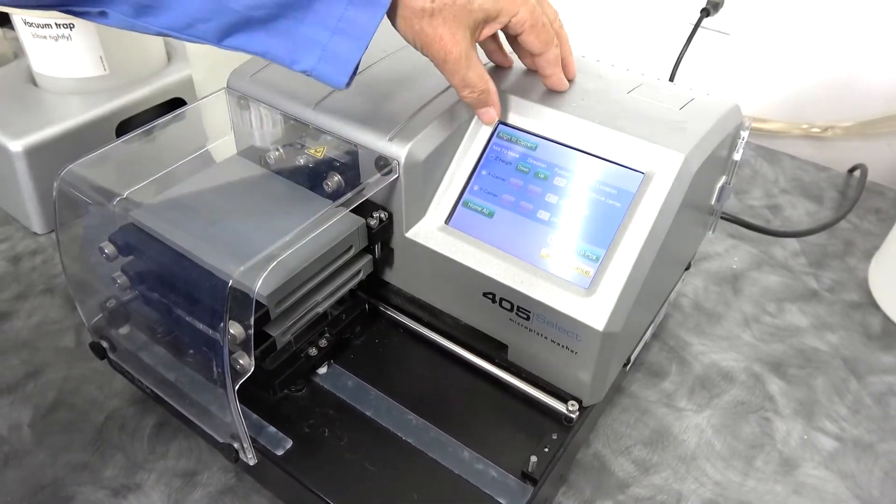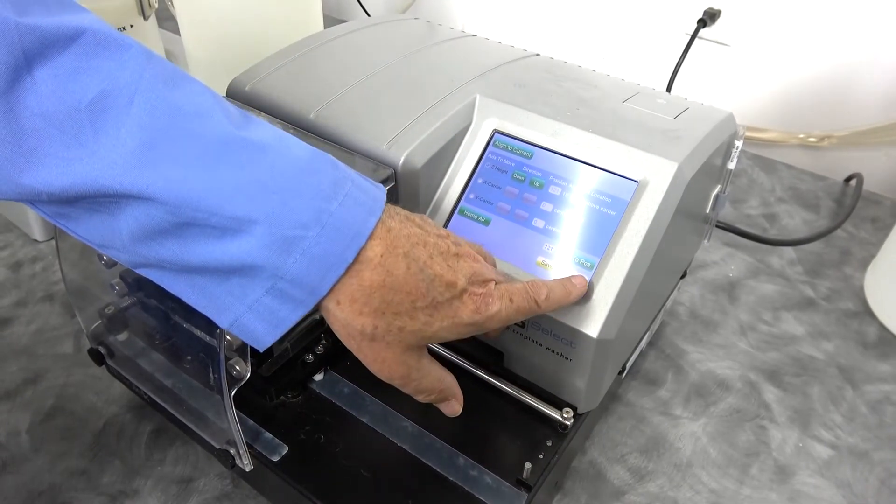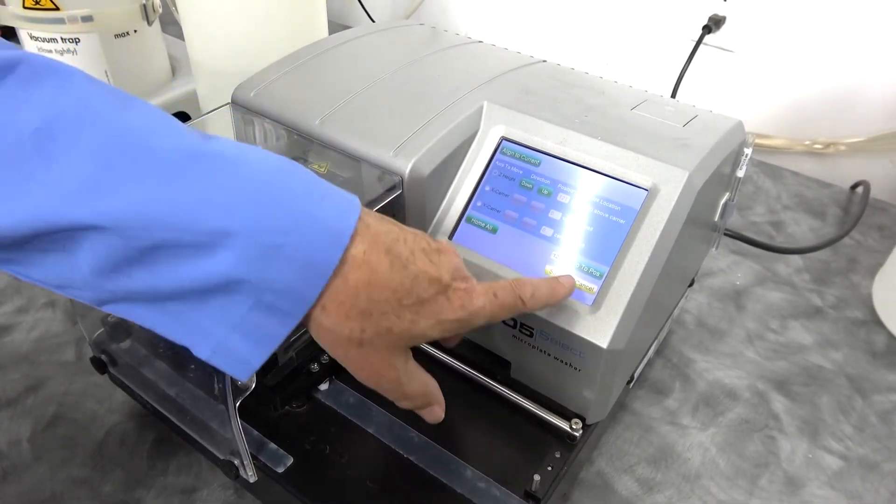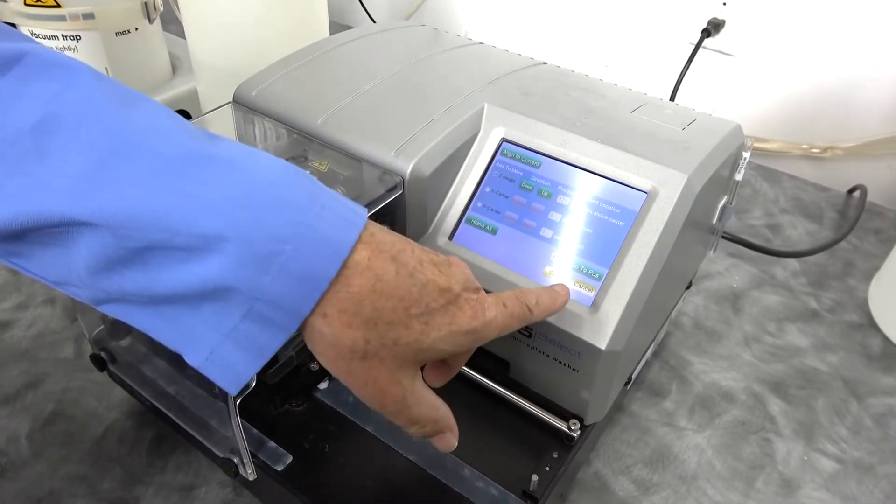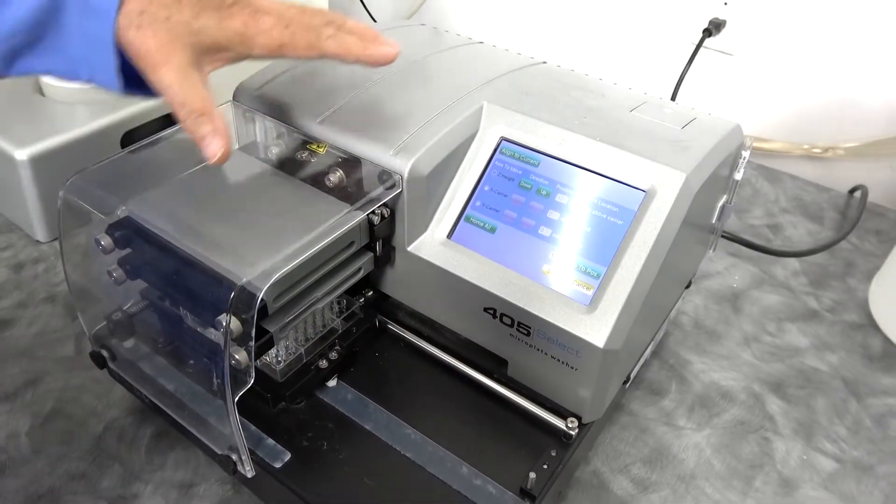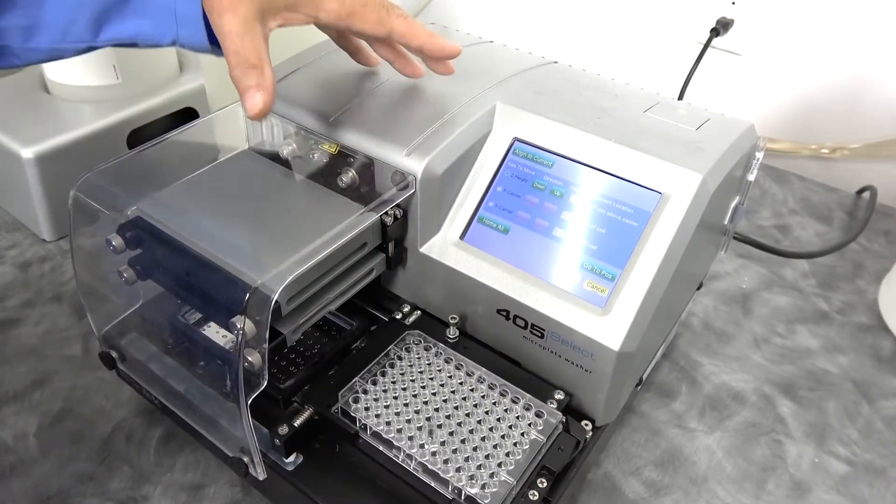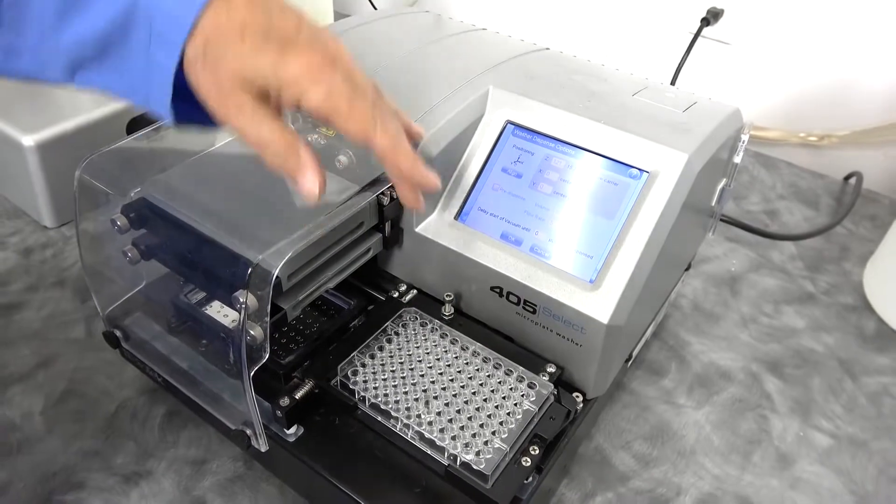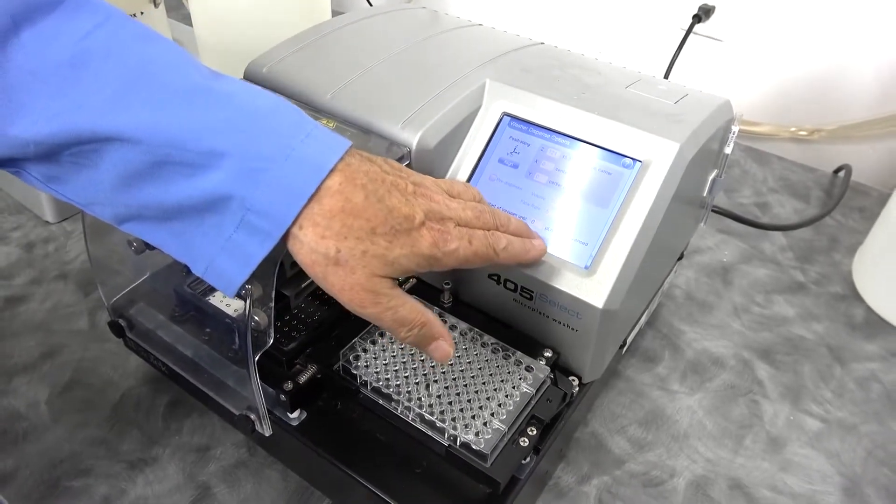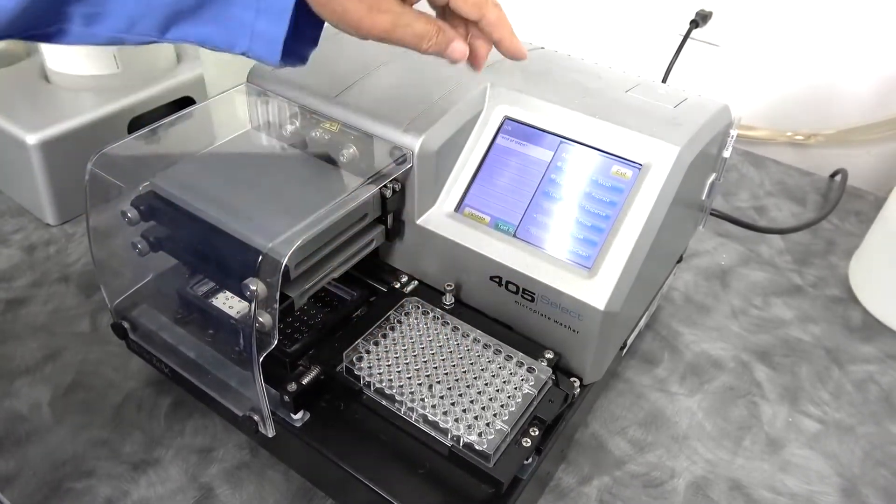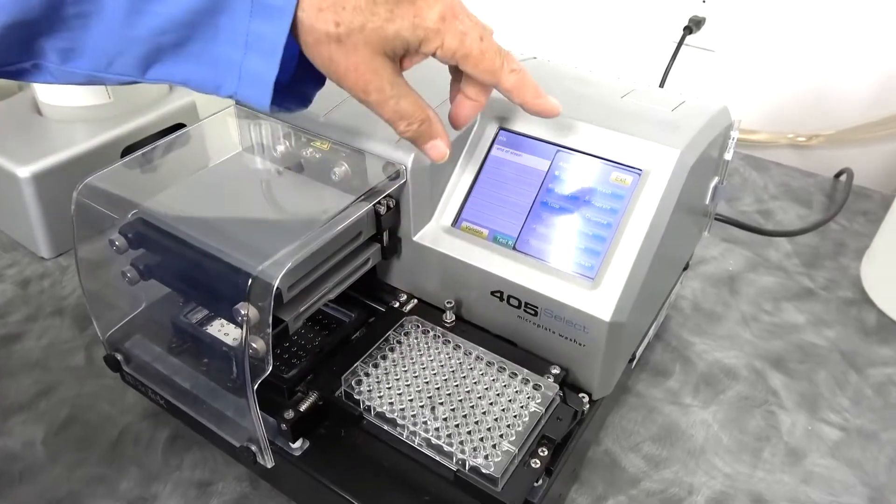I don't necessarily want to save this one since that's a good definition for it, but very easy to program and customize it. So you can stack those different steps. One of the steps that I used was an auto clean followed up by a wash.